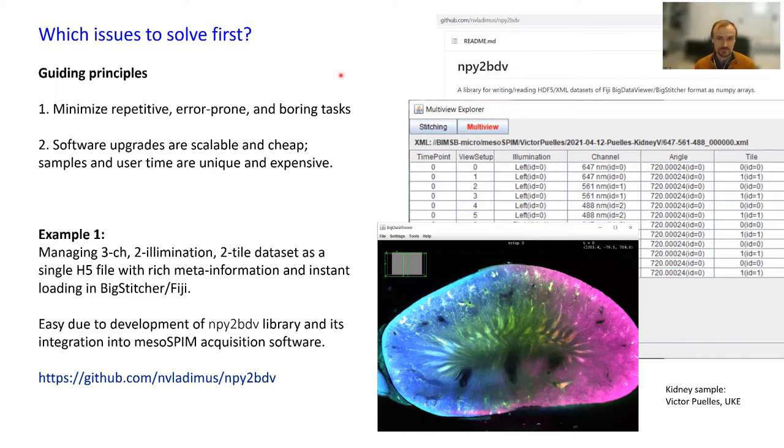One example of recent developments is a way to manage multiple channel, multiple illumination, multiple tile datasets in mesoSPIM. One option is to save every stack into its own file, but there's a more optimal way. I developed a library called npy2bdv which allows writing such multi-dimensional datasets into H5 format that is compatible and drag-and-drop ready for processing in Fiji BigStitcher. This is an example of such a dataset on the right, so you have a very user-friendly overview of your data and very responsive visualization even for very large datasets, hundreds of gigabytes.